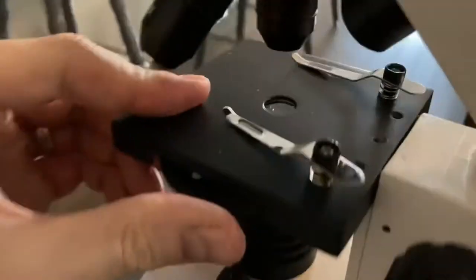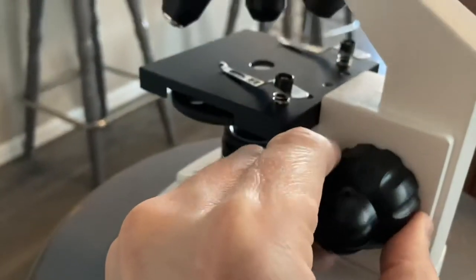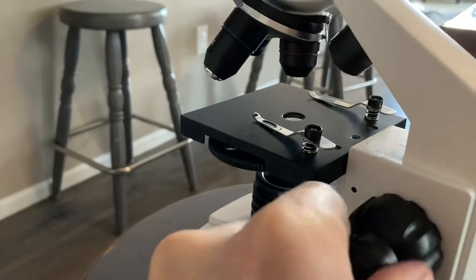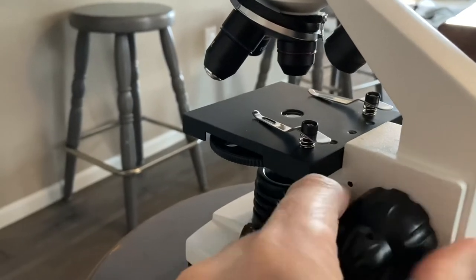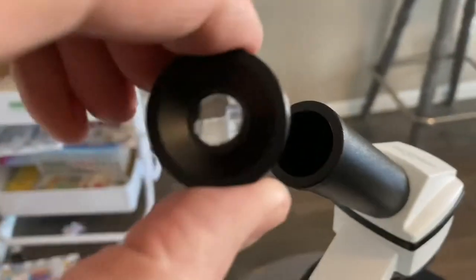This other dial — I'm not sure of the name — controls color filters: red, blue, purple, etc. Then there's the coarse tuning and fine focusing, which basically brings the stage all the way up closer to your lens. It does have three lenses.